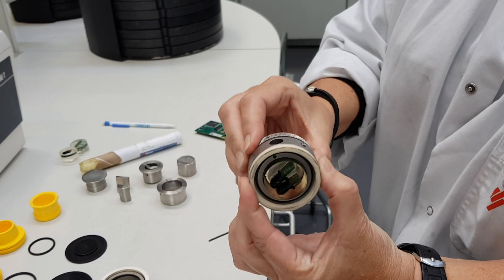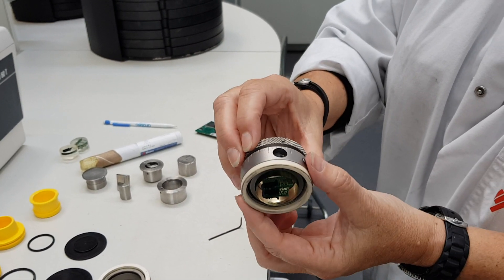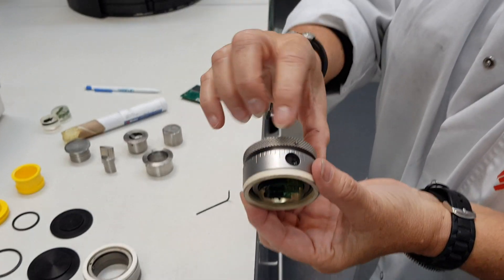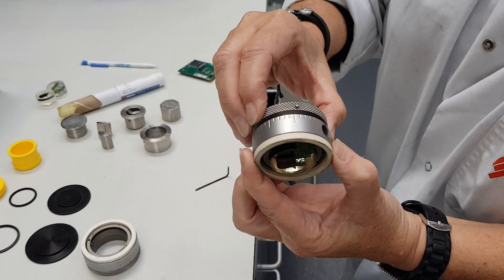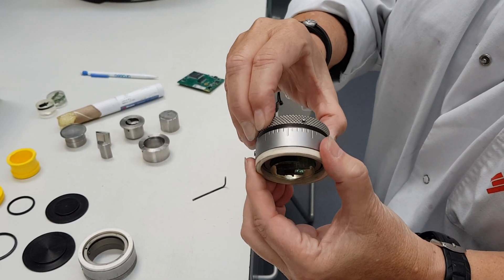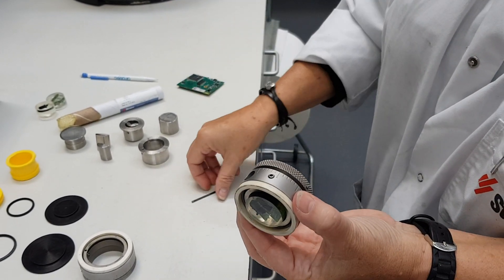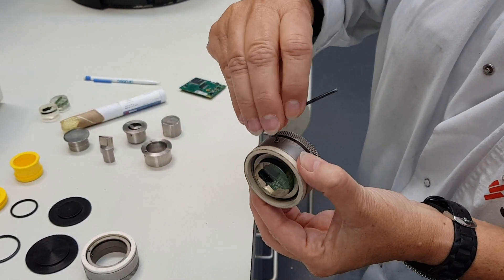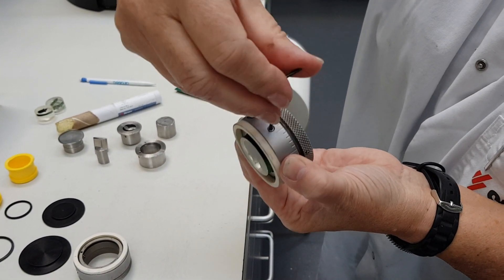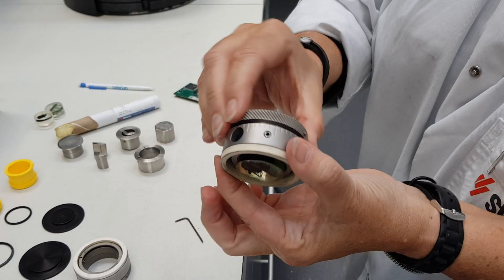Now I can turn this one. I can always look here to see how much I would like to remove. In this case, let's say I would like to remove 700 microns. So I go 100, 200, 300, 400, 500, 600, 700. And when I'm here, I close this screw here to fix the thread and fix the positioning. So now I cannot move it anymore.